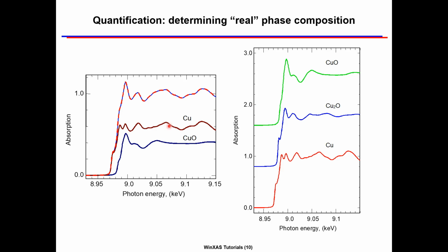In theory, the phase composition can be directly calculated from the matrices obtained by the factor analysis procedure. While this is implemented in WinXAS and may work for a near perfect fit between chemical phases and references, XANES refinement remains the more universal analysis approach for a variety of sample spectra.